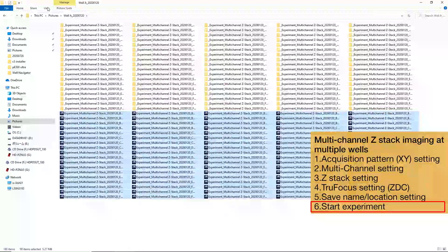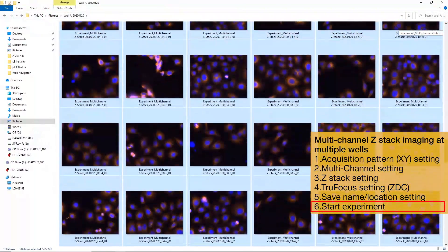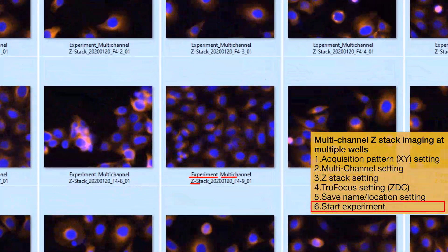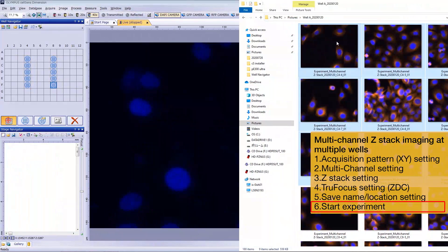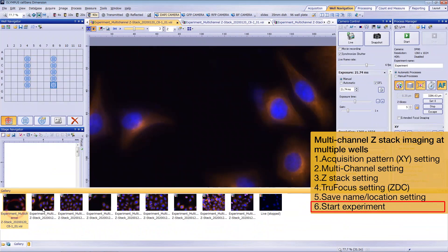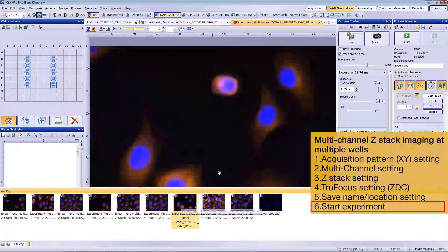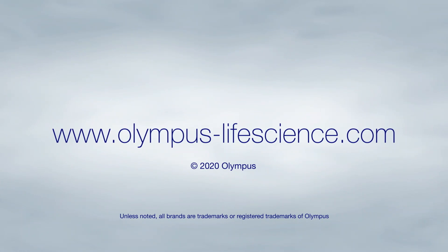You can quickly overview the images. Make sure the file name shows experiment name, process type, date, and well position ID as we specified in the acquisition settings. We can drag and drop images for more detailed observation. Overview images are available in the Gallery tool window, making it easy to browse images. For more information, visit olympus-lifescience.com.